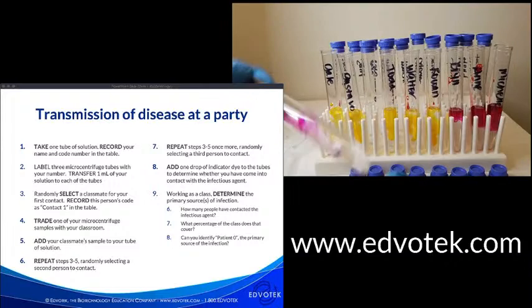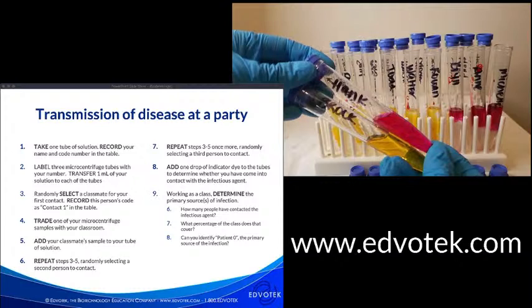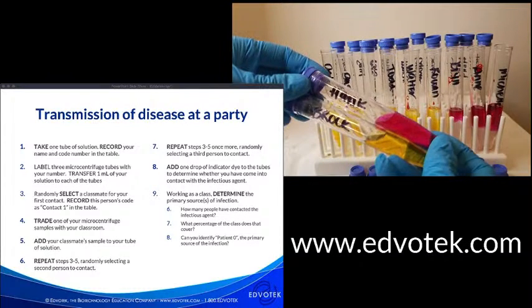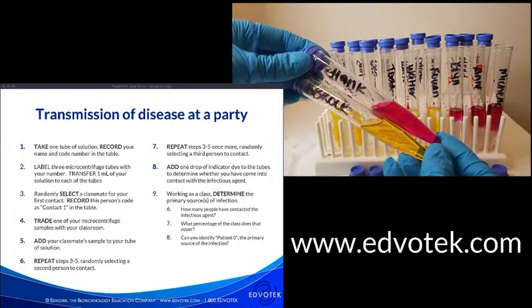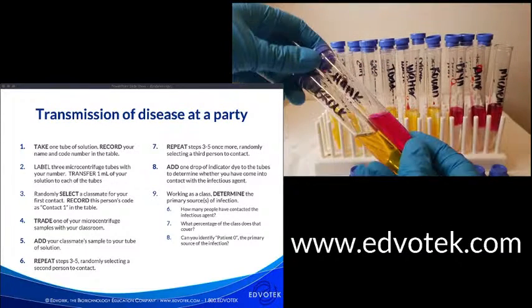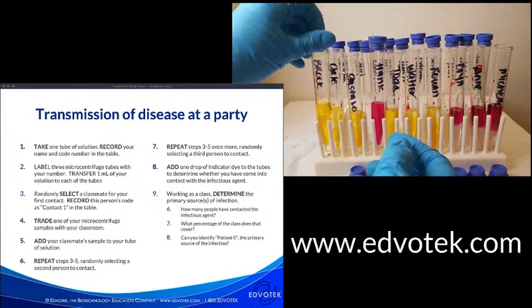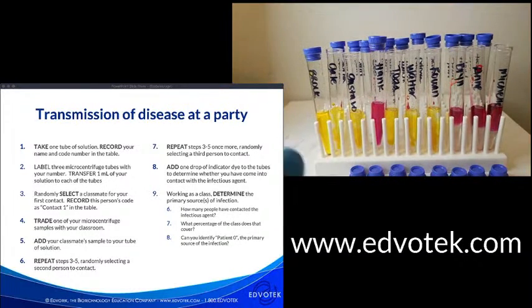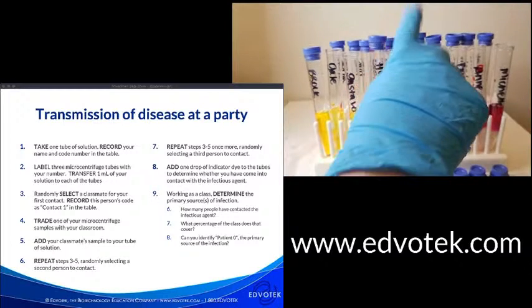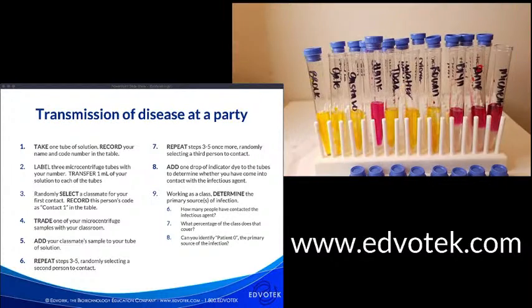I just want to show you the difference between Hank, who is red, who is clearly infected, and Brock, who is yellow, and is clearly not infected. Your students would have these clear solutions. They would walk around the class exchanging fluids with one another, and then we would do this, essentially a test. These tests allow us to determine who was exposed to the infectious agent. In reality, many tests wouldn't be able to give us positive results right after transmission.